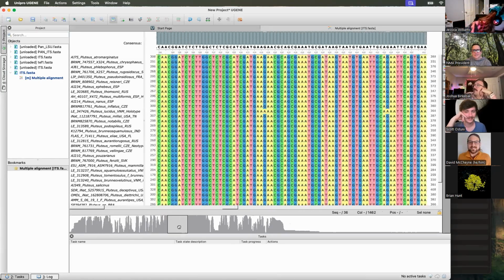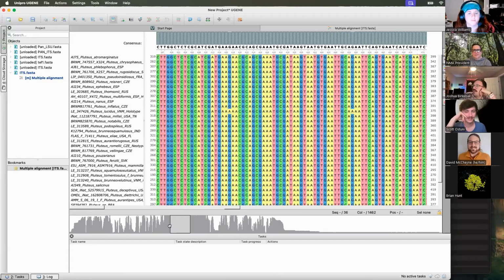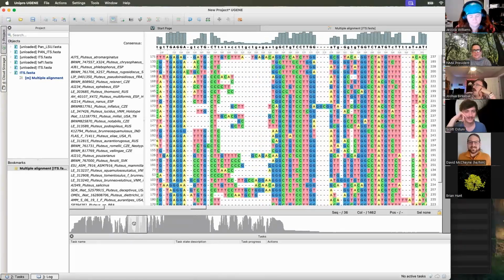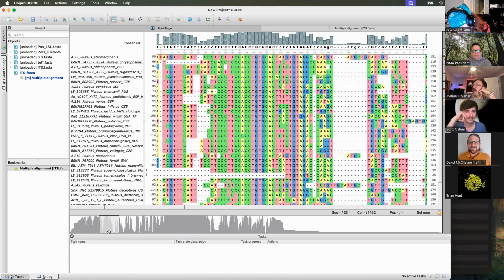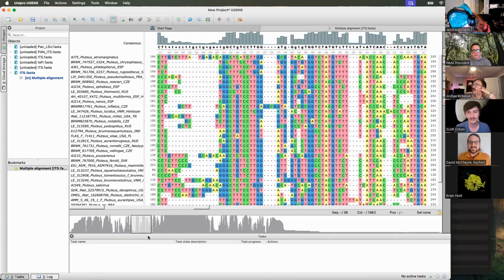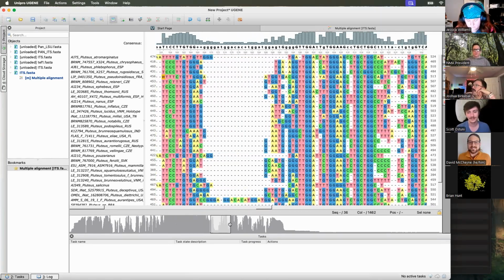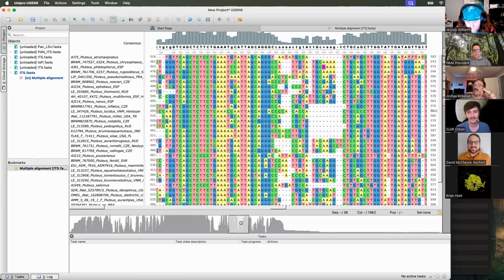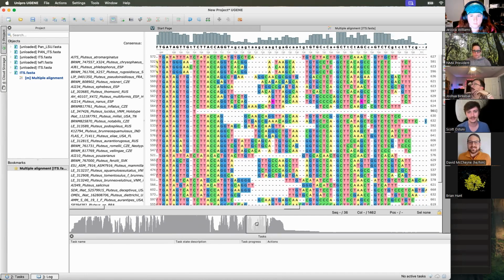This looks better. Here's our 5.8S. We've got our big, mostly the same, very few changes region. Here's ITS1. It's noisy, but it feels like there's a lot of decent signal in this data set, even though there's a lot of gaps. And ITS2, sort of the same picture here. There seems to be a lot of real signal. It's not just making total jumbled noise out of it. That section maybe a little bit.